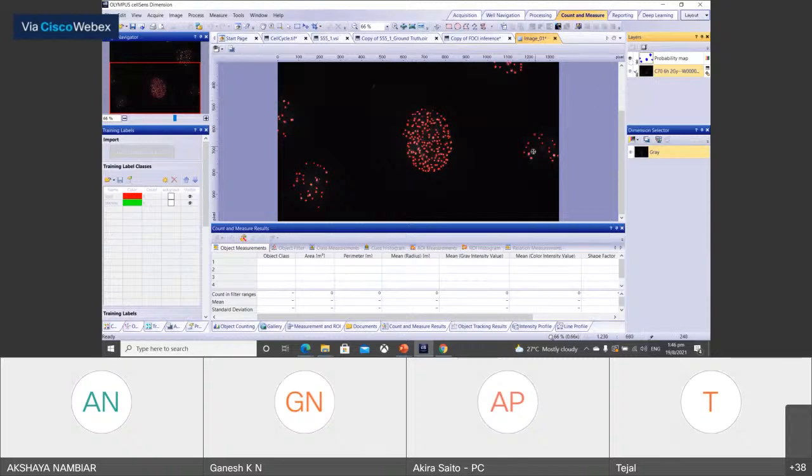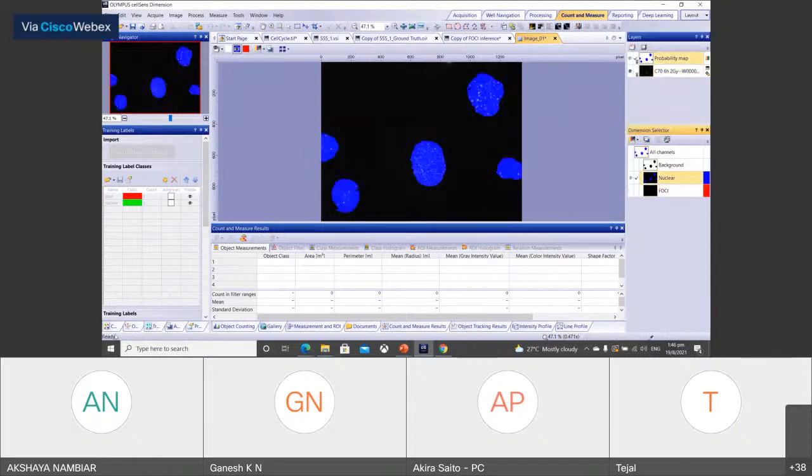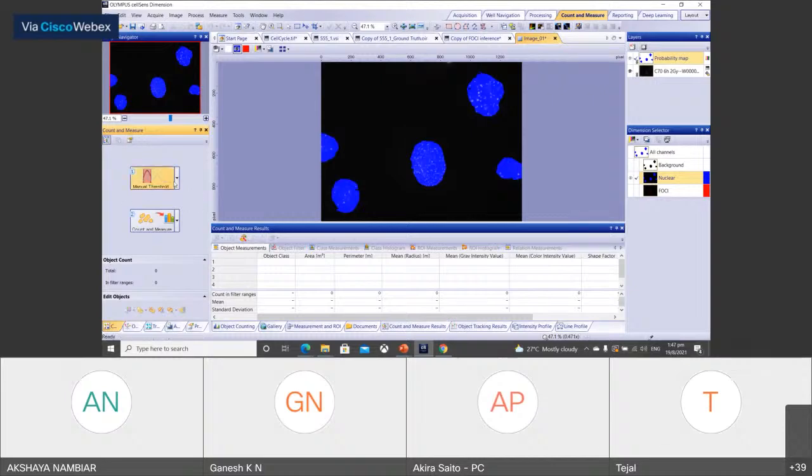So after this segmentation, we can go to count and measure and see how many.